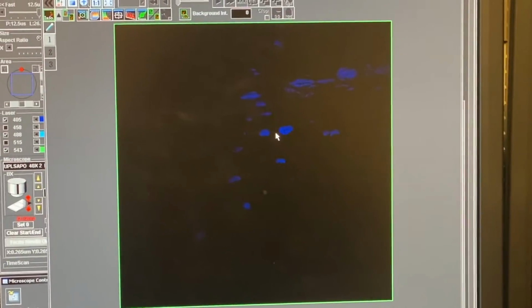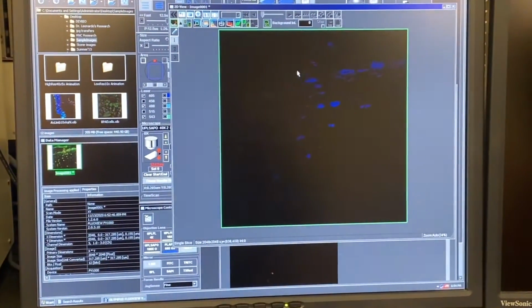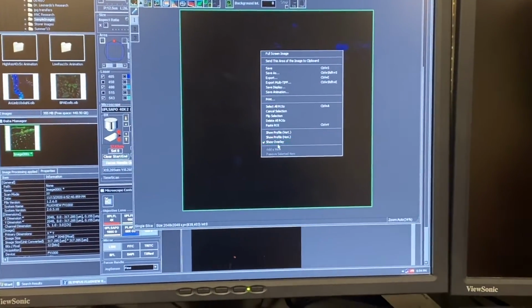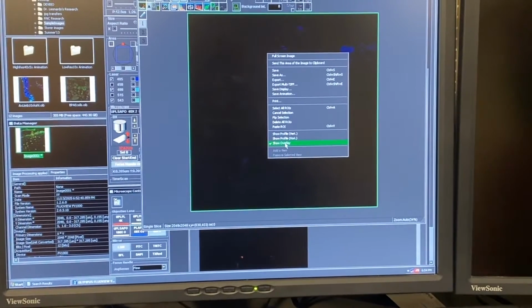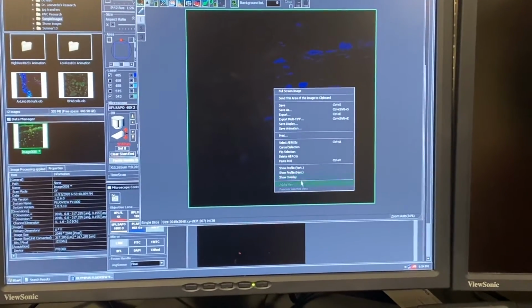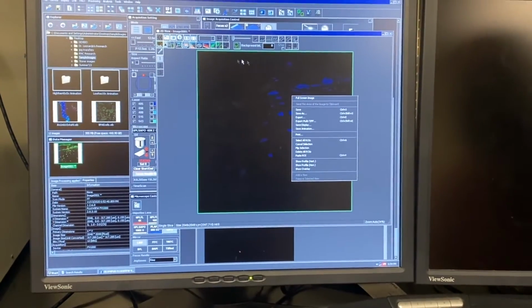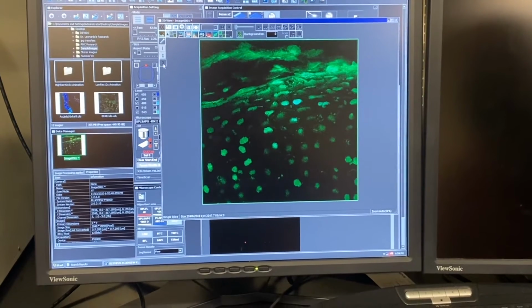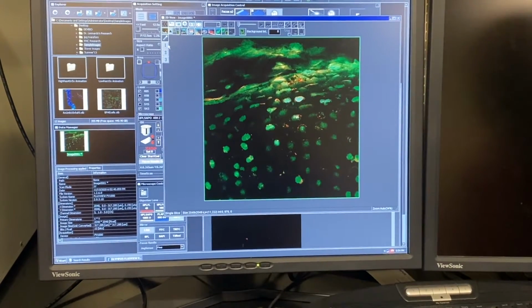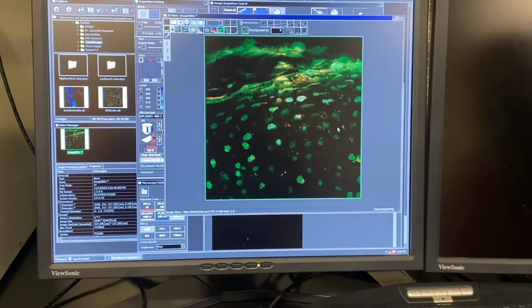But what if I want to see all three colors in the same image? I want to overlay them. Then I'm going to right click and choose to show. I want to add a view. Well, I can just click over here. That isn't the way I wanted to make a fourth image to do this.